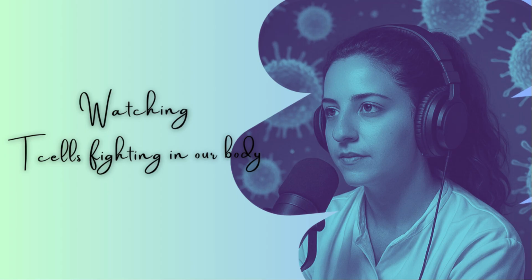So the question here is, how do we identify T cell subsets? Flow cytometry is kind of like immune system detective work. You start by tagging the T cells with surface markers, as I mentioned before. CD3 tells you that, yes, this is a T cell. CD4 versus CD8 will split your T cells into helper and cytotoxic groups. Of course, CD4 is the helper and CD8 is the cytotoxic. CD45RA and CCR7 will tell you if they are naive, central memory, or effector memory cells. Then we have other markers like PD1, TIM3, and LAG3, that are signs of exhaustion of these cells.